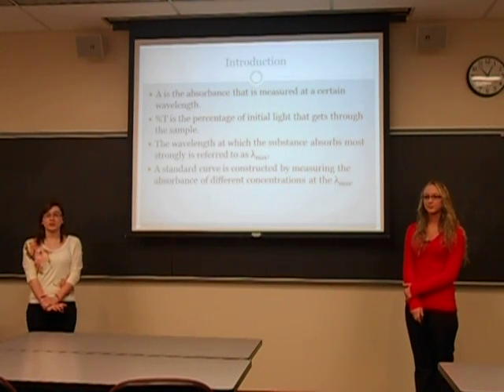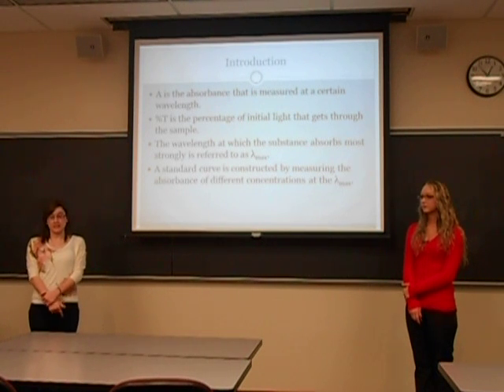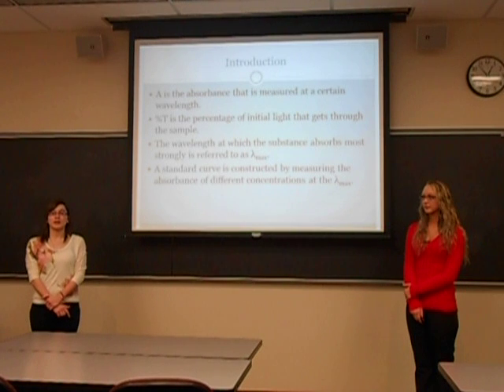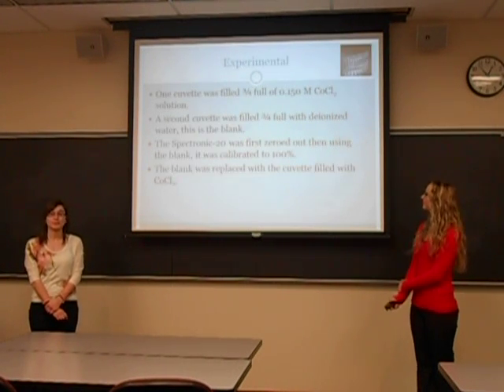The preferred choice of a wavelength can be found by seeing the wavelength at which the substance absorbs the most strongly, which is also known as the lambda max. And a standard curve can be constructed by measuring the absorbance of different concentrations at the lambda max.